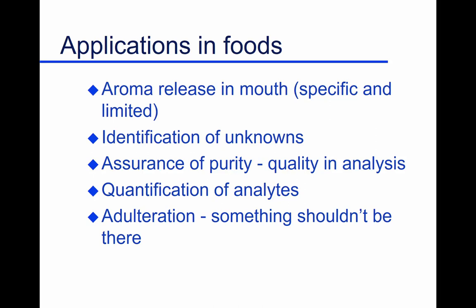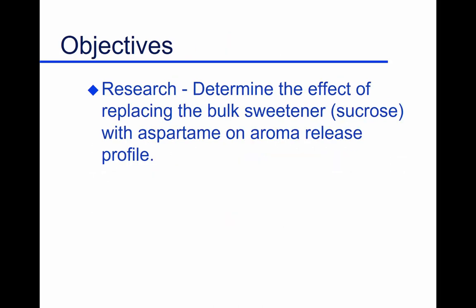Application: identify unknowns in food. There's a lot of things we're wondering about, we're uncertain about, we haven't identified. Assurance of purity, quality and analysis, quantification of analytes, adulteration, looking for something that shouldn't be there. Again, we have just a lot of application of these techniques in the food industry.